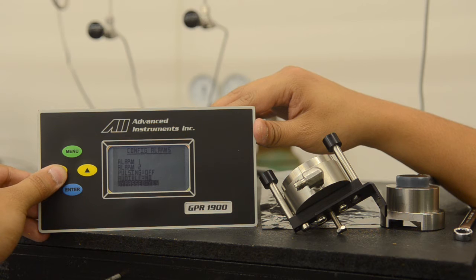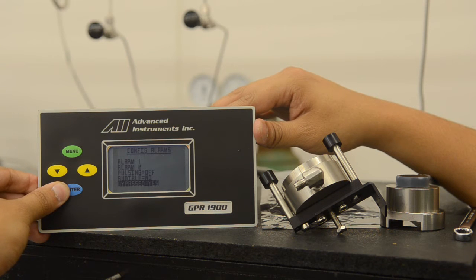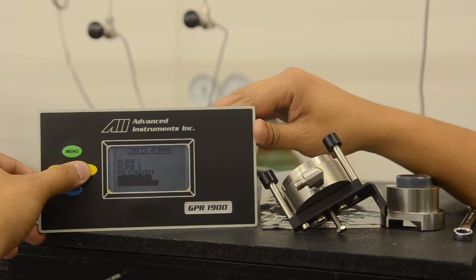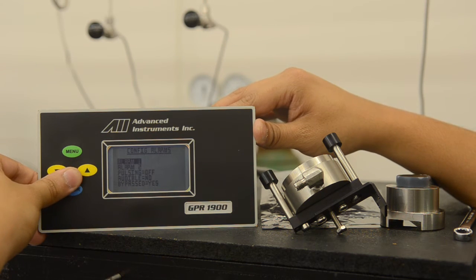We also have a bypass option. If we want both alarm one and two to be bypass, we can hit yes on that. No to allow both alarms to be enabled. Again, this is done by selecting enter.